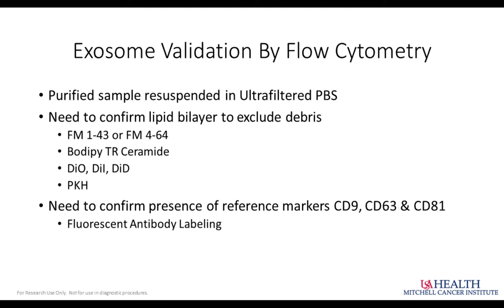You cannot call a particle an exosome unless it has at least one of those markers on the surface. Let me repeat that. If you don't see at least one of those 3 CD markers on the surface of the exosome, you cannot call it an exosome. So these are fluorescently directly conjugated antibodies.